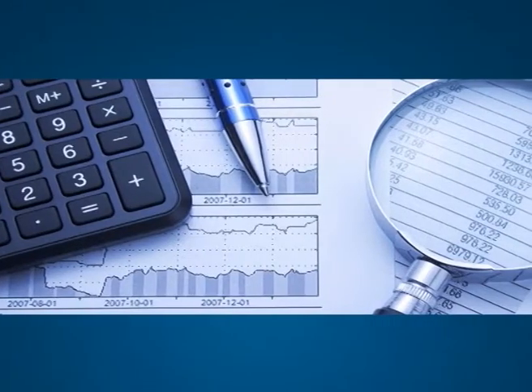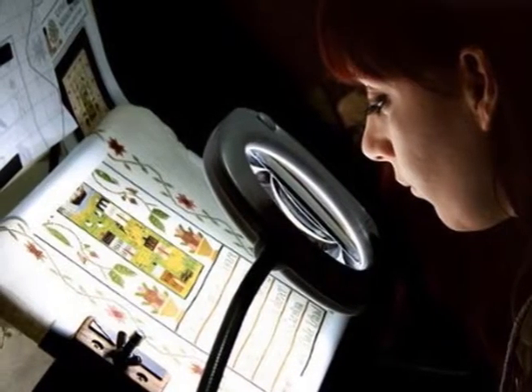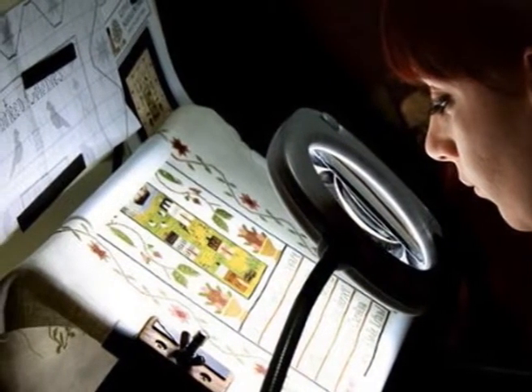In routine, our eyes are capable enough to see objects and activities around us. But for minute and in-depth examination of objects, we need scientific aids. In forensic examination of documents, many inconspicuous vital clues remain unnoticed by unaided eyes. For the study of various properties, characteristics, function and behavior of a substance, some special equipment is required. In question document examination, equipment having a good range of light sources and magnifying facilities solves the majority of problems.